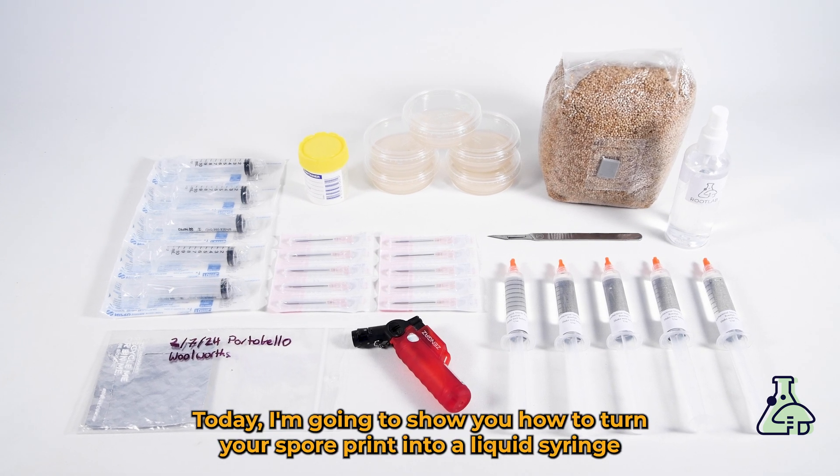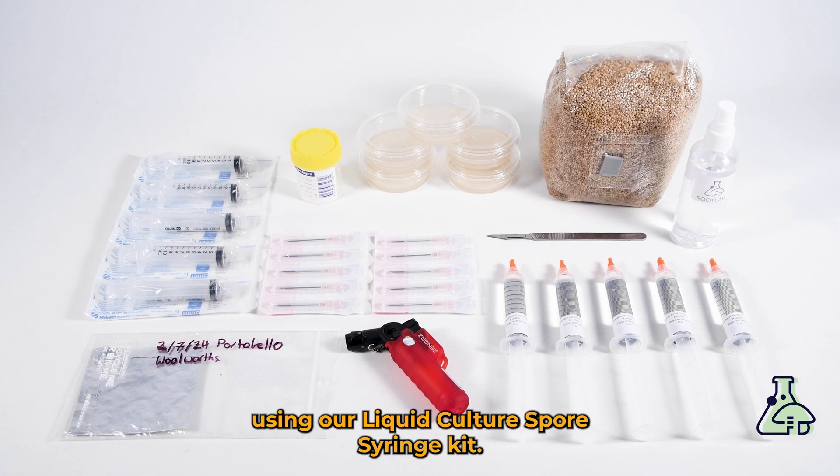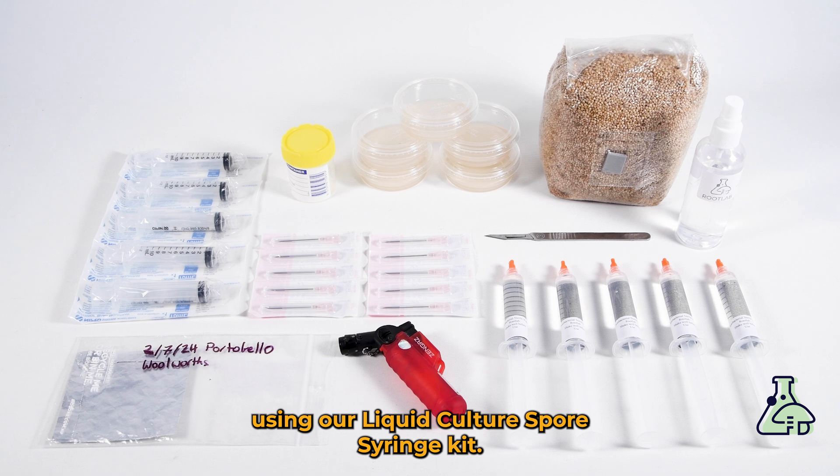Today I'm going to show you how to turn your spore print into a liquid syringe using a liquid culture spore syringe kit.